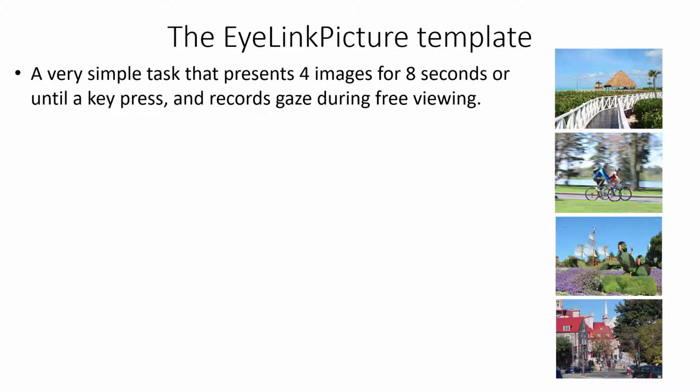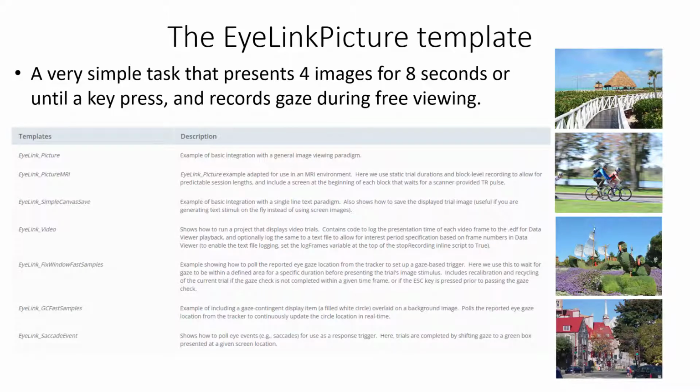Most of the code in the script is designed to illustrate the range of EyeLink integration functionality that is possible via ePrime. You may not require all of the components in your own script, but it can be useful to know what is possible. Some task-specific functionality is not shown in this example, but can be found in others.